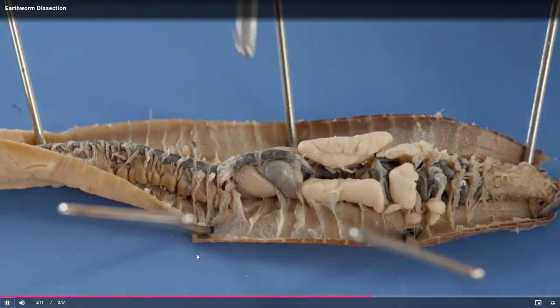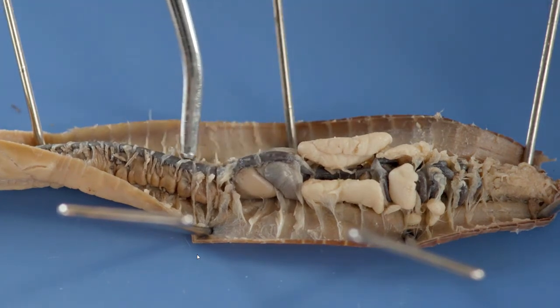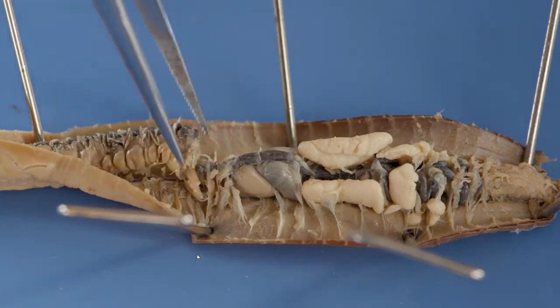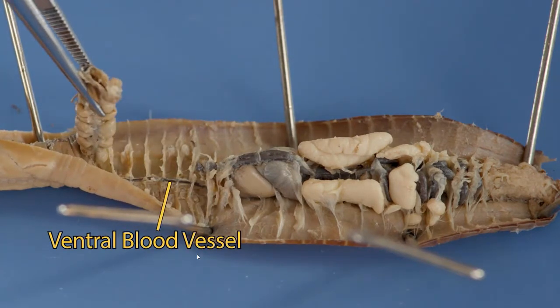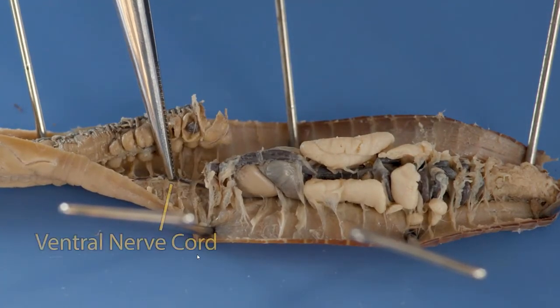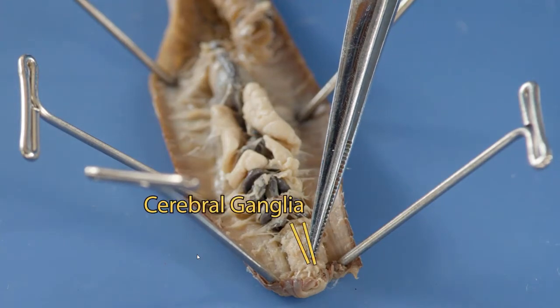The circulatory system consists of the 2 blood vessels and 5 pairs of aortic arches. Locate the dorsal blood vessel and the 5 aortic arches. To locate the ventral blood vessel, lift a portion of the intestine posterior to the gizzard. Running along the ventral body wall below the intestine is the ventral nerve cord, a part of the nervous system. At the anterior end of the earthworm, locate the pair of cerebral ganglia, which functions as the earthworm's brain. The ventral nerve cord extends from these ganglia down the body of the earthworm.